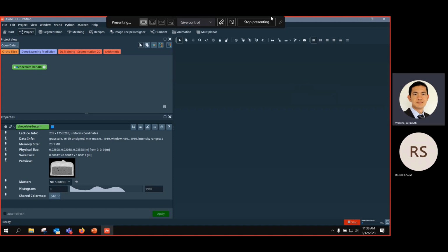And it's really important to use a mouse, because later you will see that for a lot of tasks you need the middle mouse click to visualize and activate your data. Okay, let's continue. Here I open the data, chocolate bar. I already see some properties down here with a thumbnail. So next I would like to visualize them.